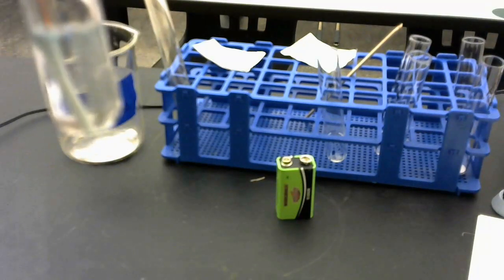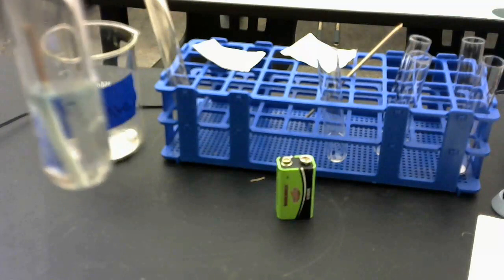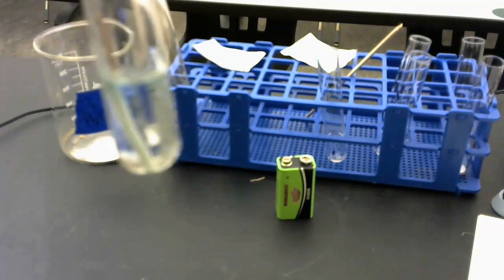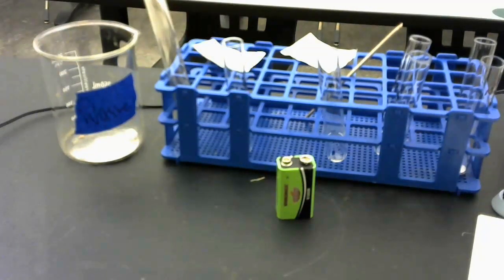So if copper displaces silver, then what am I producing? I'm producing copper nitrate, and then I'm producing silver solid. And so what I love about this reaction is we're actually producing solid silver particles. Okay, we're going to come back to that to make better observations in a little bit. Make sure that you have balanced your equation, you've written your word equation, and you've written down your observations.